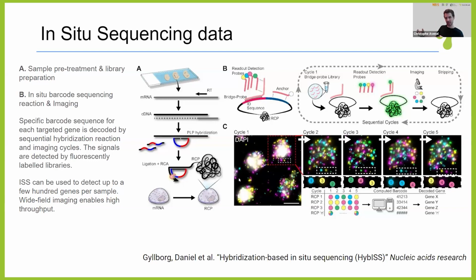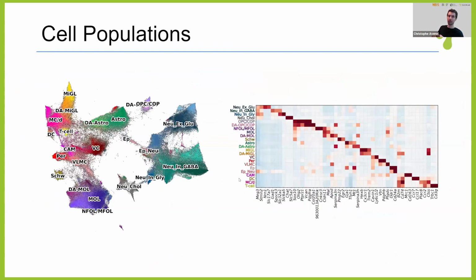From these cells with genes inside, you can do clustering, so you can get cell information, like a cell population of what you have. You get different clusters, and then you can annotate these clusters based on the differential gene expression inside each cluster. Depending on the main genes inside each one of your clusters, and with experts that know what these cells are supposed to be, you can annotate your population.